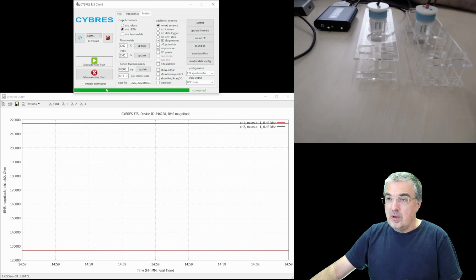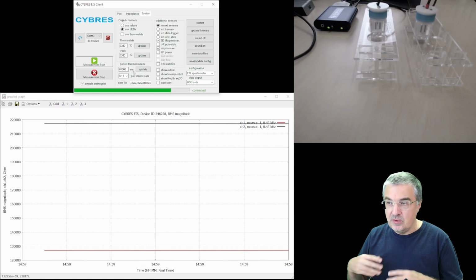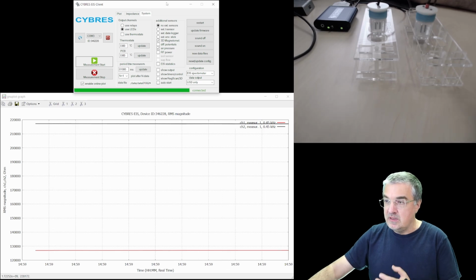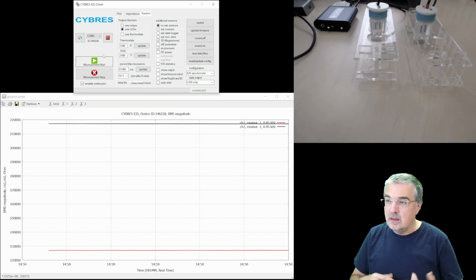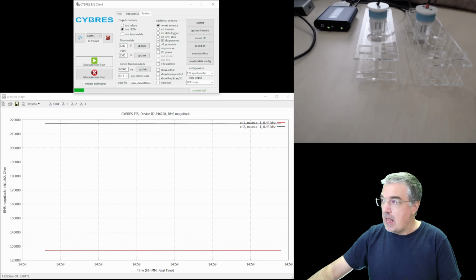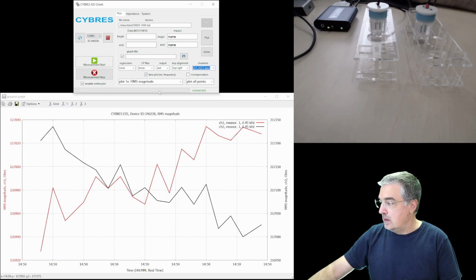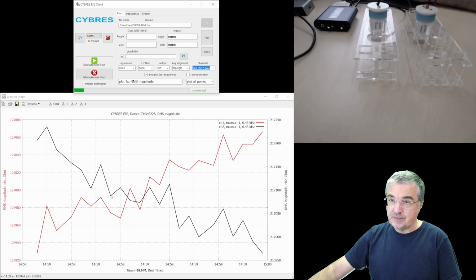Here we have a more compact client, client 1.4. We try to simplify the visual representation, but the system is still fully functional. Here you can enable different apps with different analytic tools. The functionality of version 1.4 is the same as all the clients before. Now I switch to two-channel representation. As typically, you see some noise in both channels.